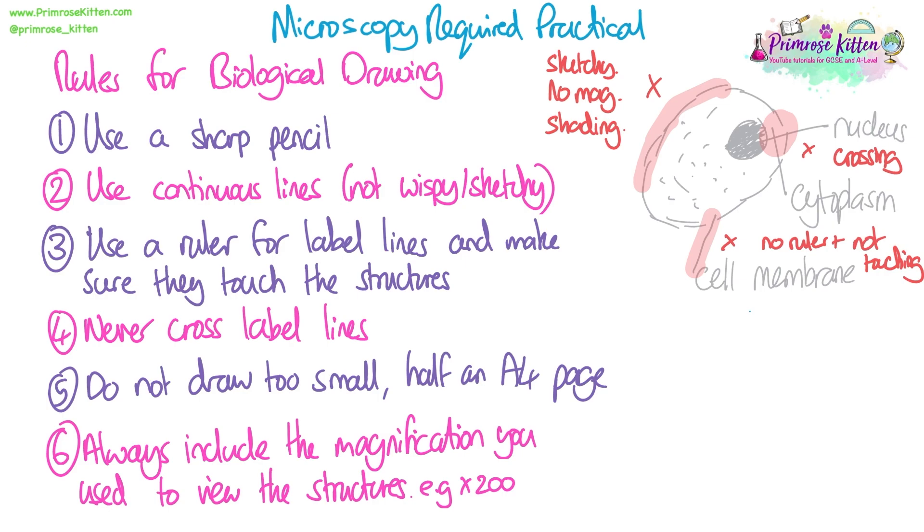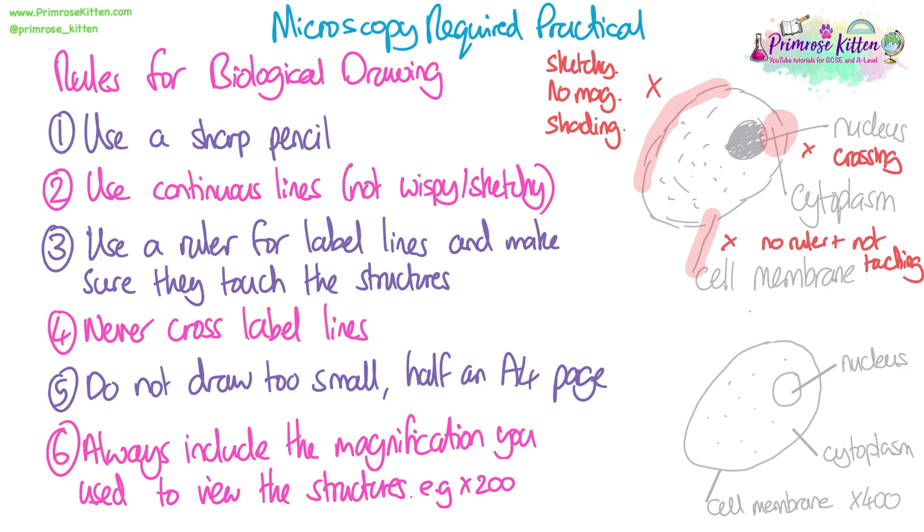I've redrawn that diagram to follow the rules. I've got my continuous line around the edge, not wispy. I've got some mild dot work, and I've got my nucleus, cytoplasm, and cell membrane all labelled with straight lines drawn with a ruler, and they're all touching what they should be. I've also included my magnification — I looked at this using a ×10 eyepiece lens and a ×40 objective lens. Multiplying those together gives a total magnification of ×400, which is what I put on the diagram.